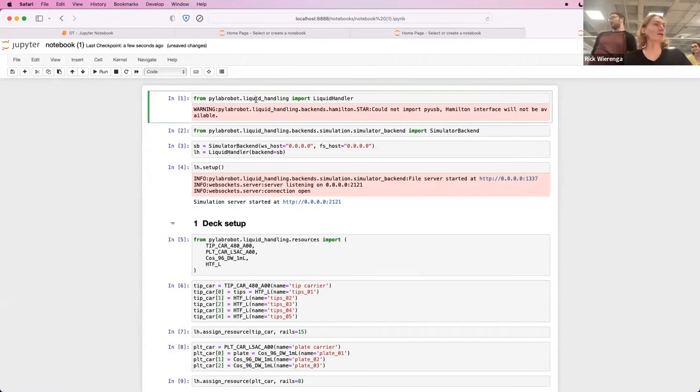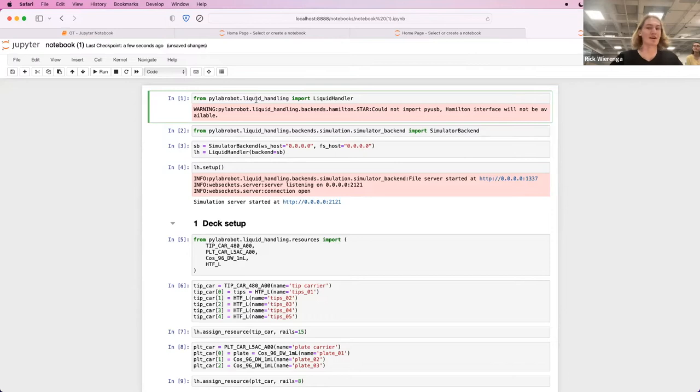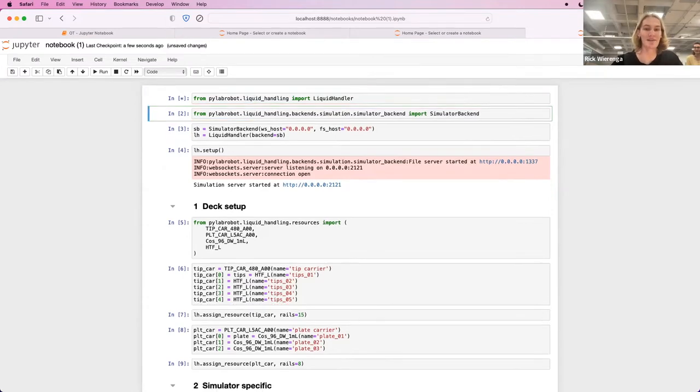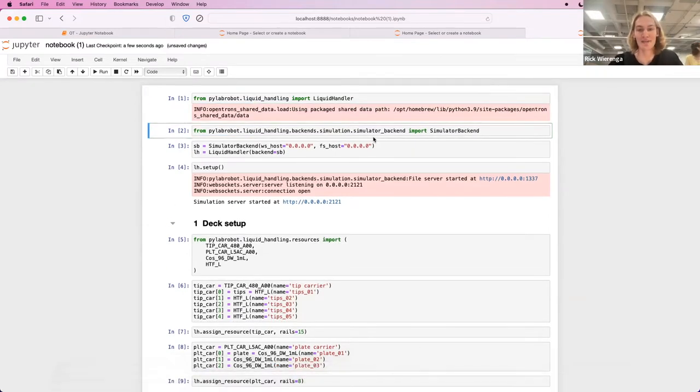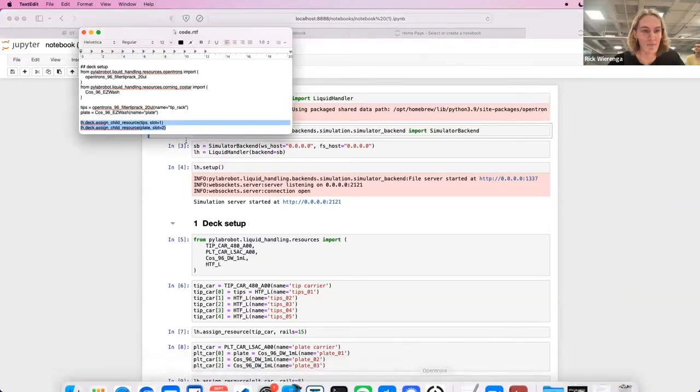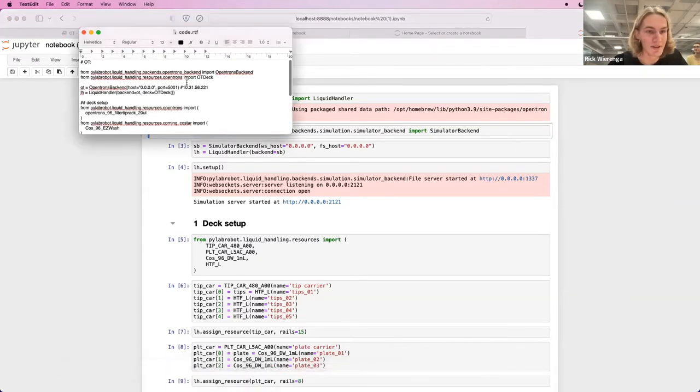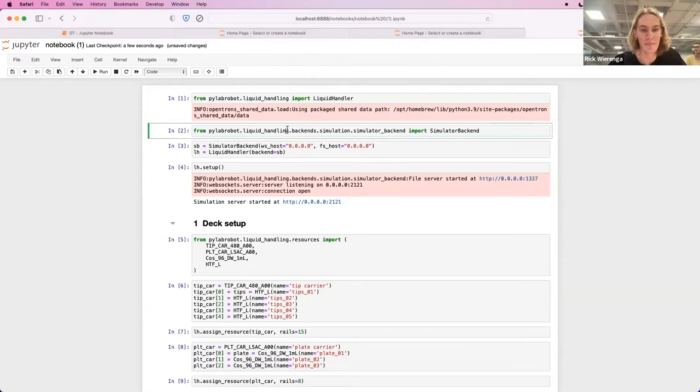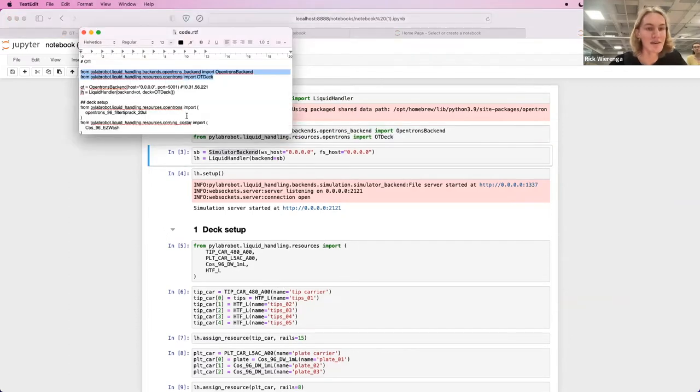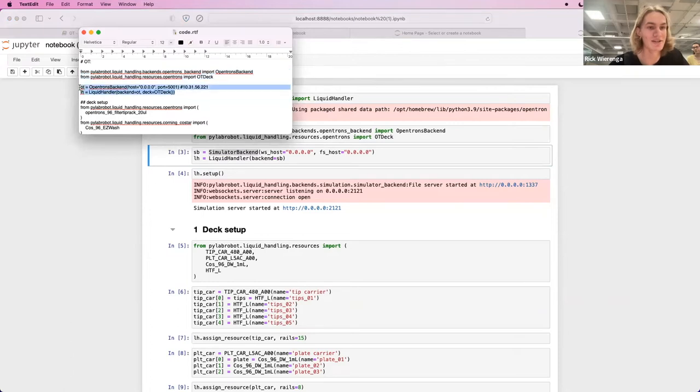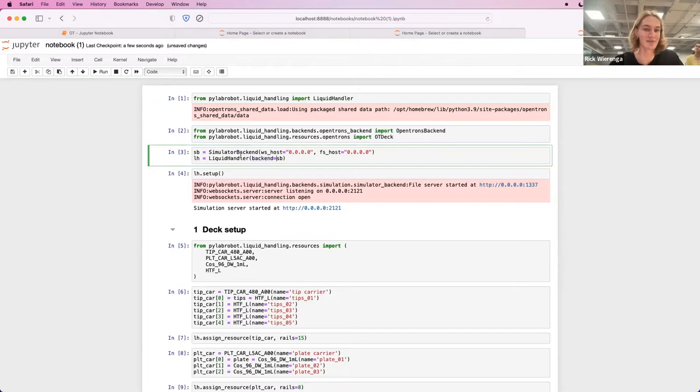And then there are of course a couple of things to change to go from the simulated environment to an actual robot. We can still use the same LiquidHandler API, but then instead of the simulator backend, we're gonna use the OpenTrons backend. And then instead of instantiating a simulator backend, we will instantiate the OpenTrons backend. And then you can see where we pass backend equals the simulator backend here. We're gonna pass the OpenTrons backend.